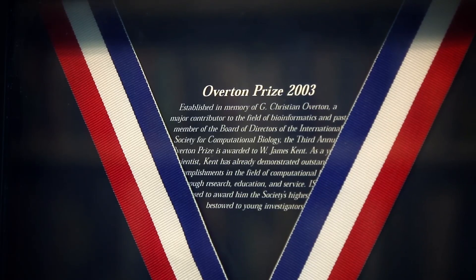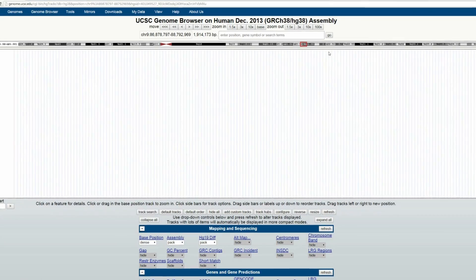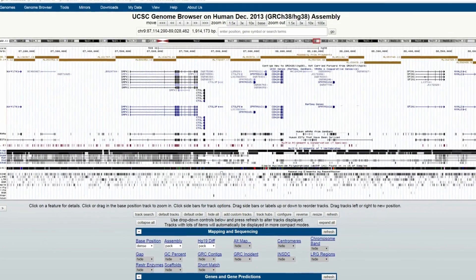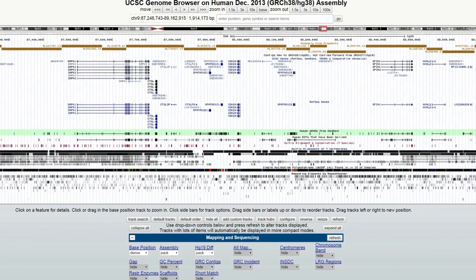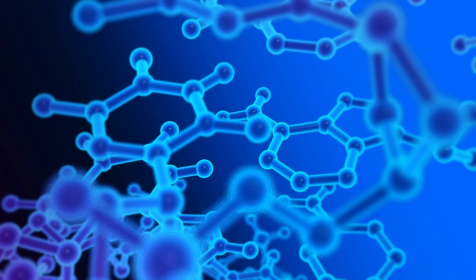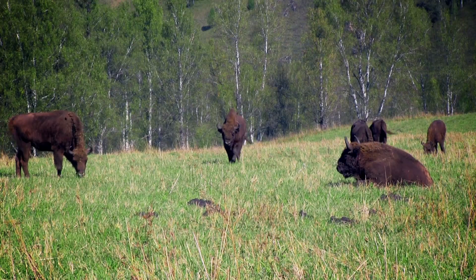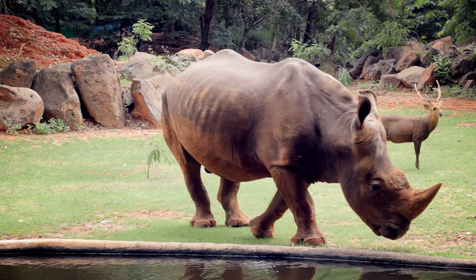The UCSC Genome Browser is a way of looking at what is happening at a particular part in the genome. The genome is big — about 3 billion bases long — and within the genome browser, rather than just looking at a long string of A's, C's, G's and T's, you can get an idea of what the function of a particular part is. One reason why we like to sequence and bring in genomes from a lot of different animals is because it lets us highlight the parts of the genome that are functional.